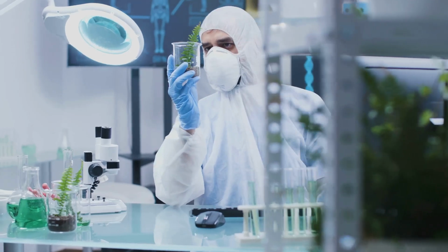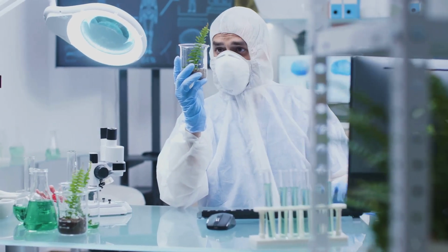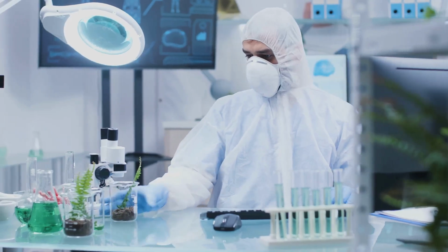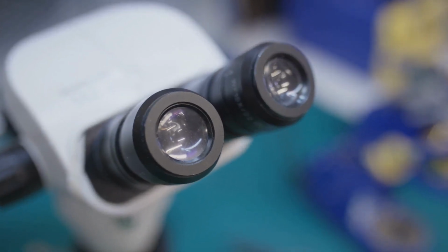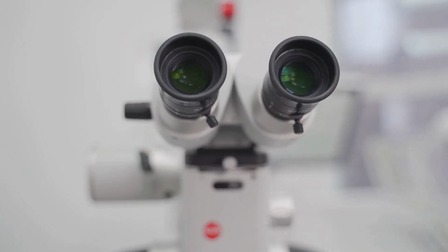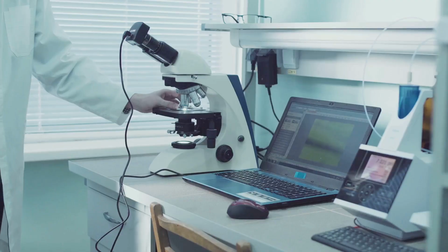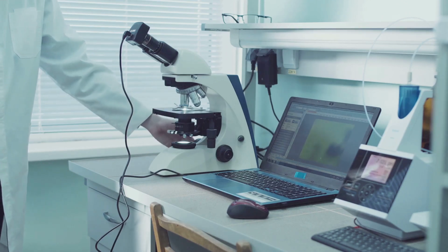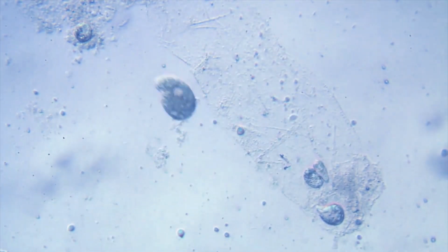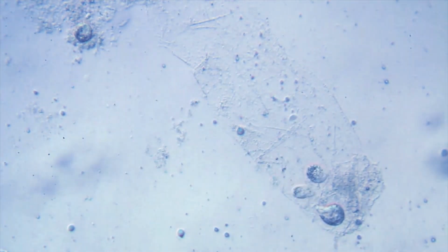Finally, the sample is washed to remove any unbound antibodies, and then placed under a fluorescence microscope. The microscope illuminates the sample with a specific wavelength of light that excites the fluorescent dyes, causing them to emit light of a longer wavelength. This emitted light is then captured by a detector, generating stunning images of the labeled targets against a dark background. These images can reveal the precise location of proteins within a cell, track the movement of cells within a living organism, or even diagnose diseases based on the presence or absence of specific markers.